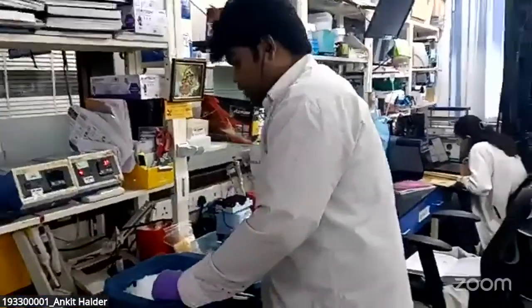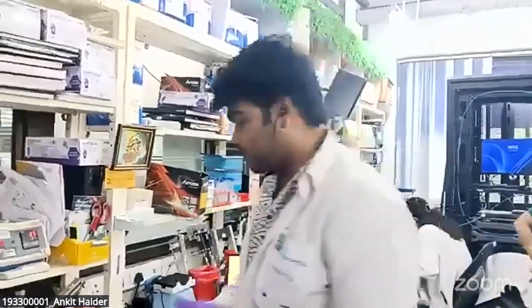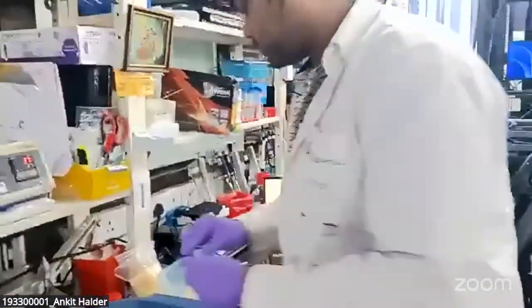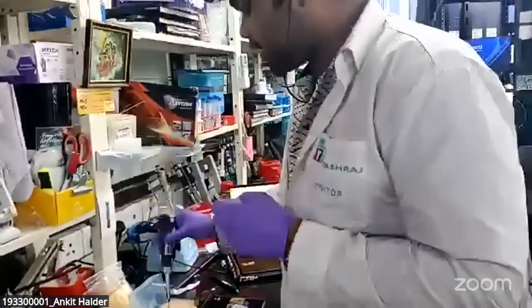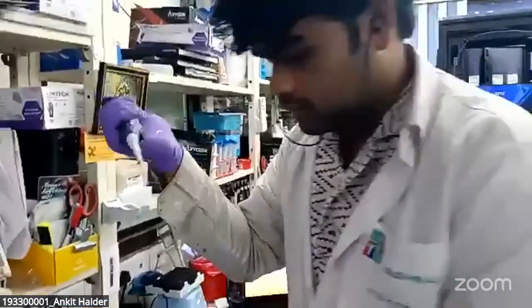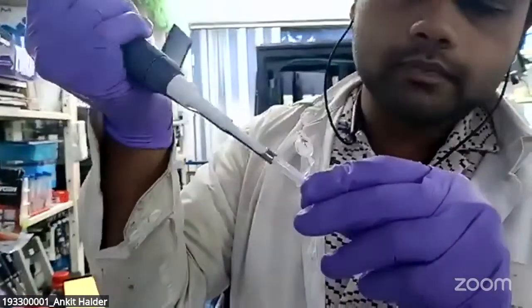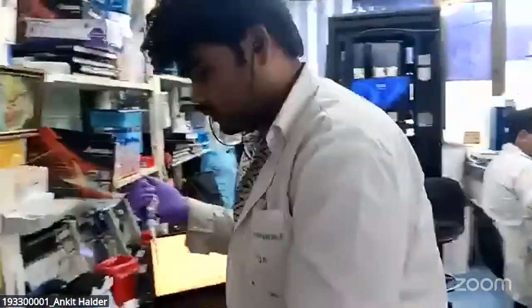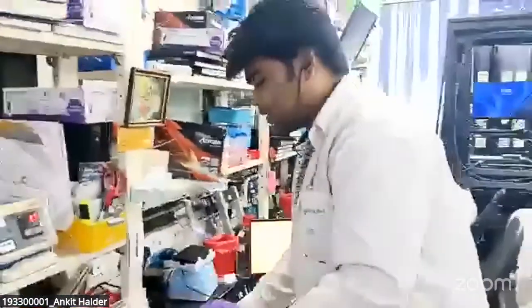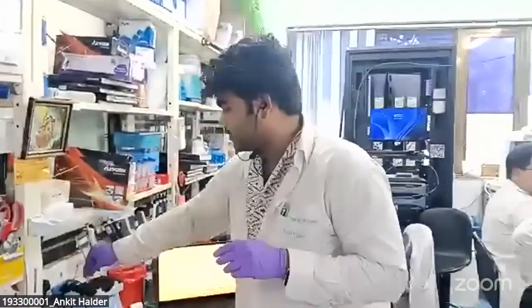And now you have the mixture of the buffer B and the lysate. Now you need to add the TCEP, which is basically useful for breaking the disulfide bond. So we take 1.2 microliter of TCEP. And after mixing every component here, you need to vortex it well.